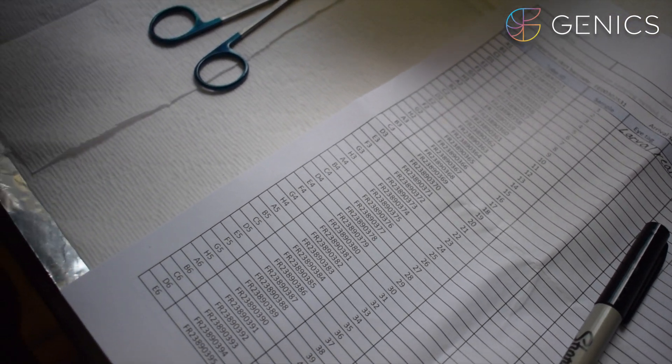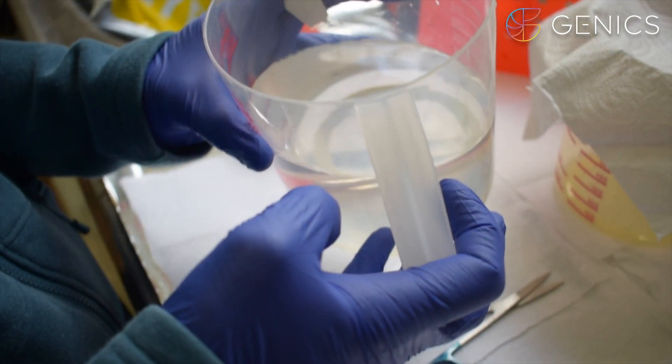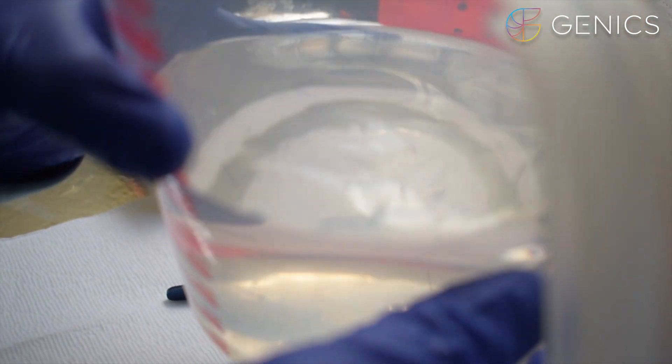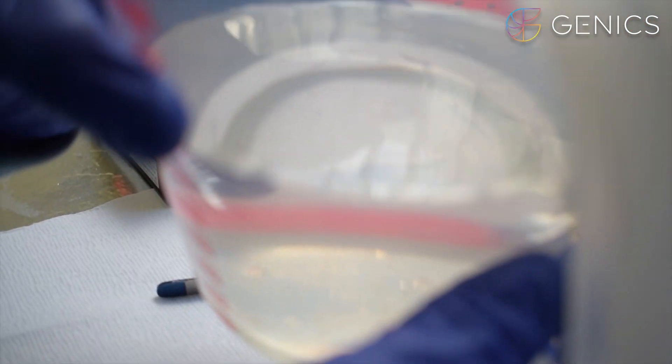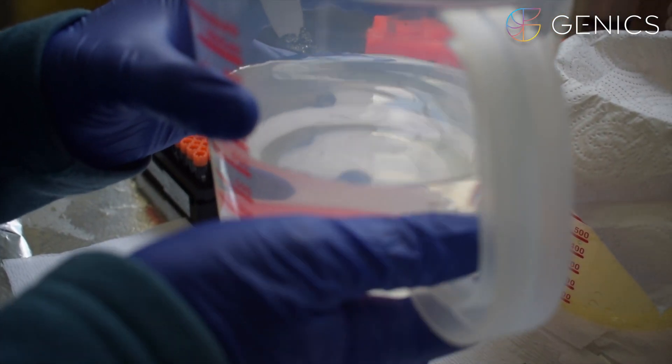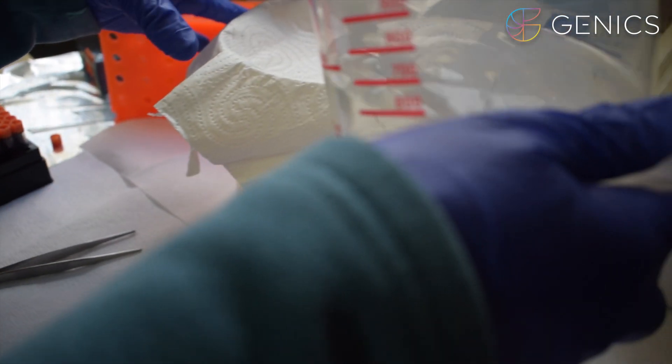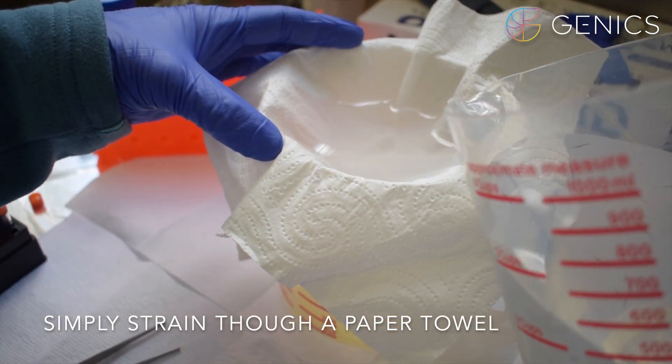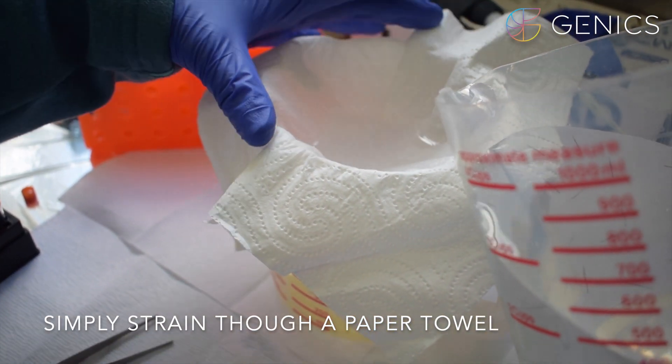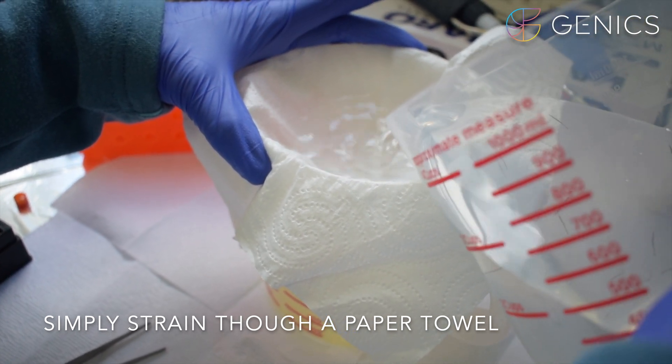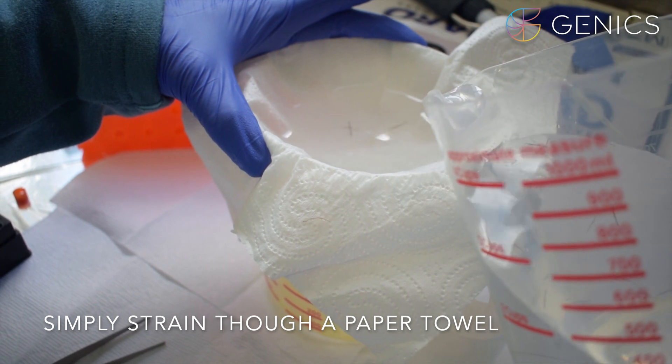Over here in this plastic container I have our tank 4 post larvae. The water has had ice added to it to slow down their metabolism to euthanize the shrimp. We then pour our shrimp through a clean piece of paper towel to strain them and remove the water. This makes them easy to pick up with the tweezers or forceps so that we can sample the head region.